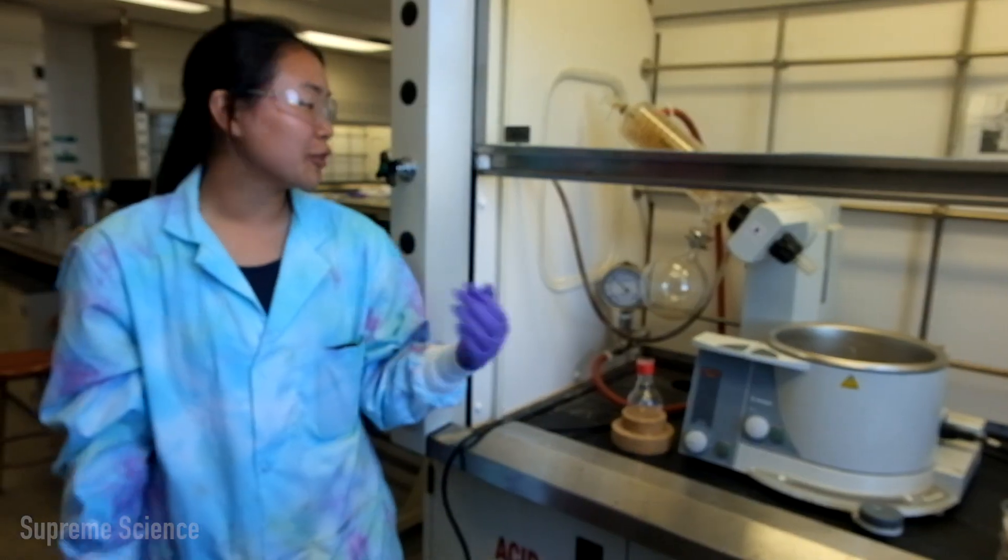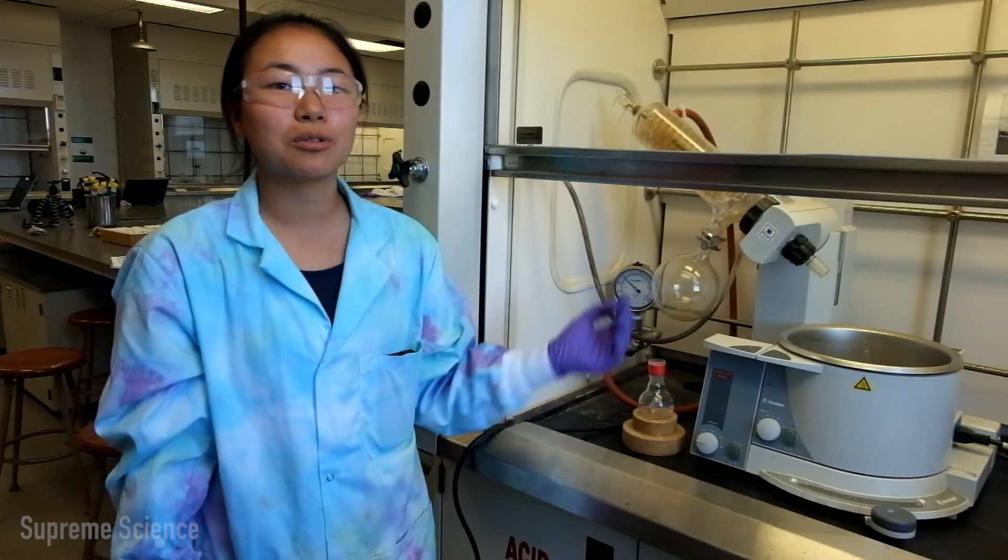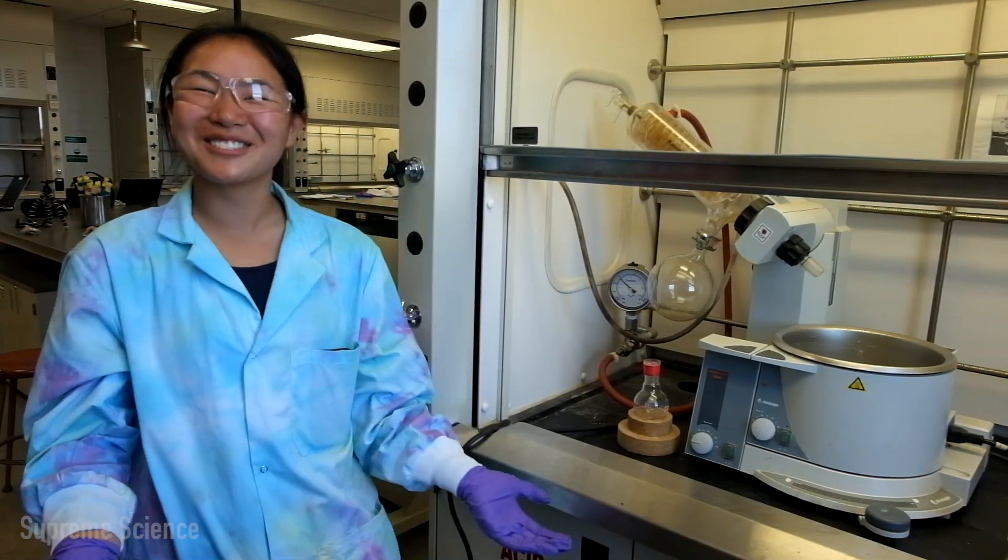Any solvent that you removed would be in this receiving flask. So you want to dispose of that properly in the correct waste disposal in the fume hood. And make sure to turn the water off. And that's how you use the rotovap.